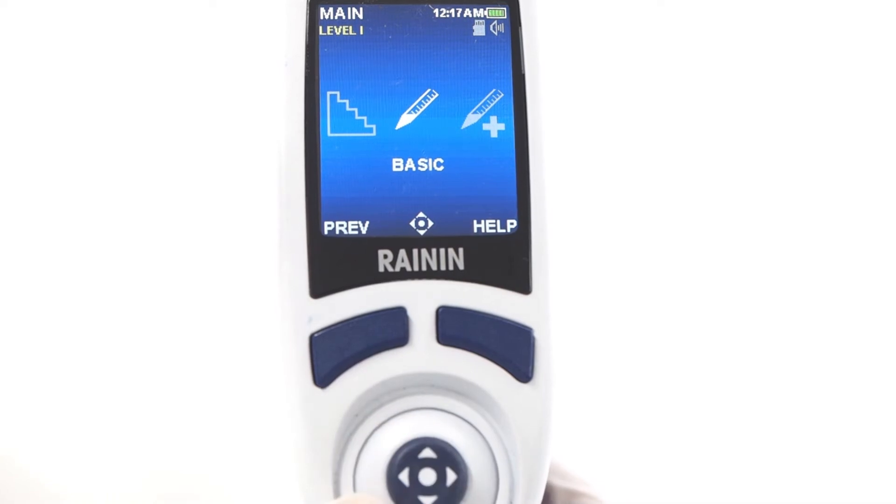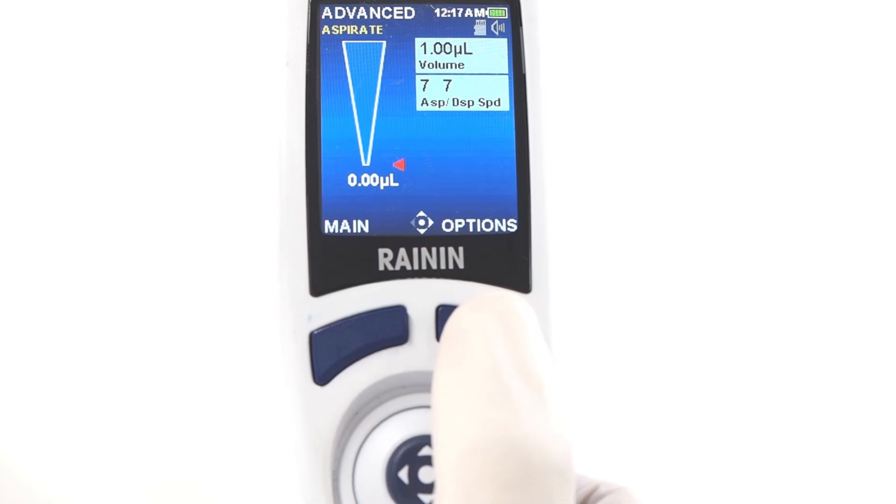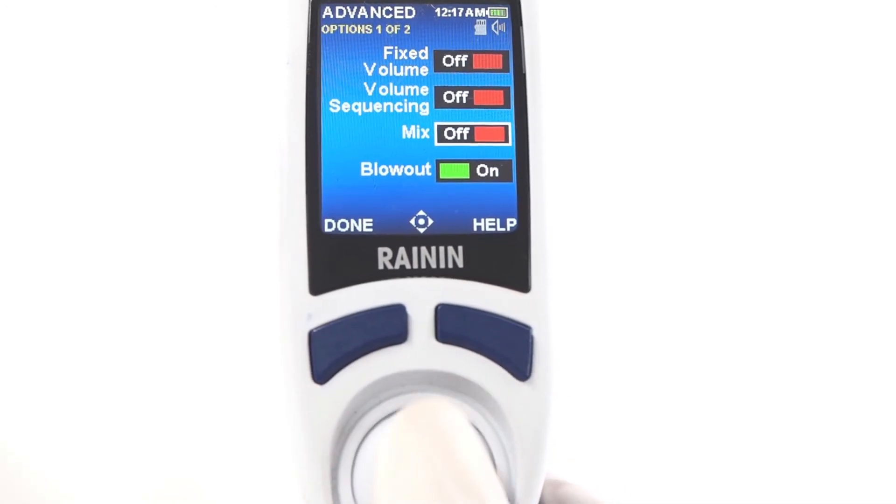Modes on the E4 give you a variety of pipetting options. For example, in advanced mode, press options in the lower right. This opens a screen of on-off switches for options like mix, volume sequencing, and others.